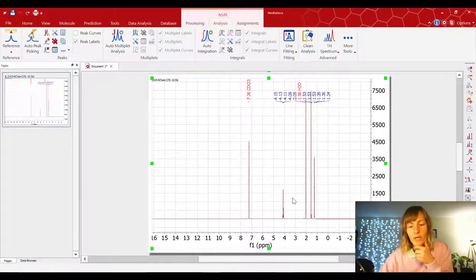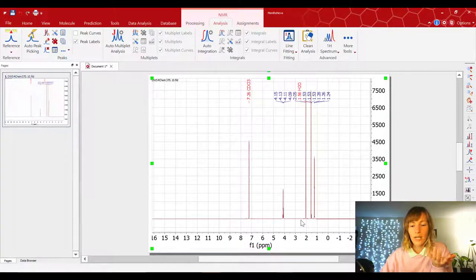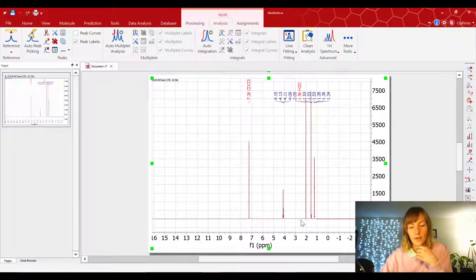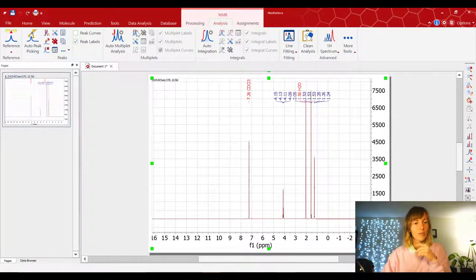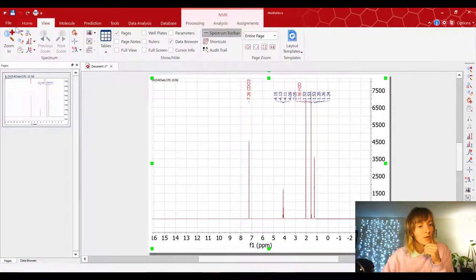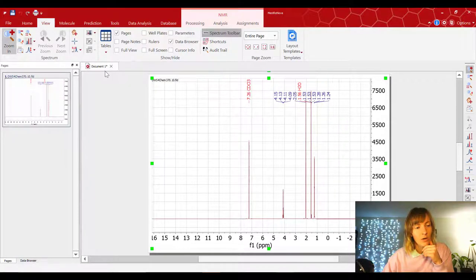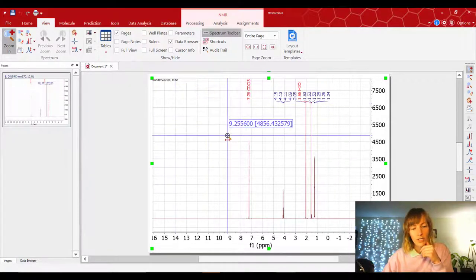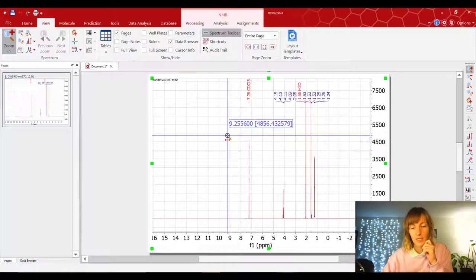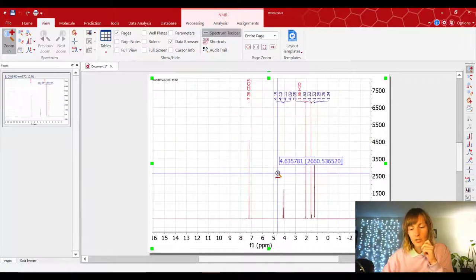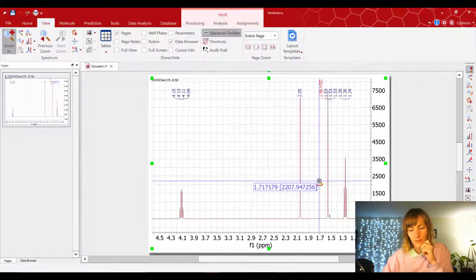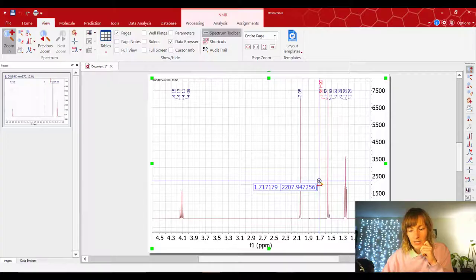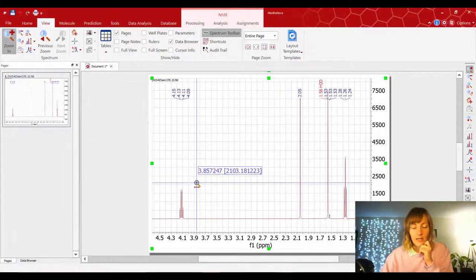Alright, so the next thing we've got to do is we have to actually look at where the peaks are, and integrate them. So let's go ahead and zoom in on the peaks. And to zoom in, you could go to View, you could press this zoom in button, or alternatively, just press Z on your keyboard, and it does the same thing. So I'm just going to zoom into this region here for now, and see how it's looking. That's looking very nice.